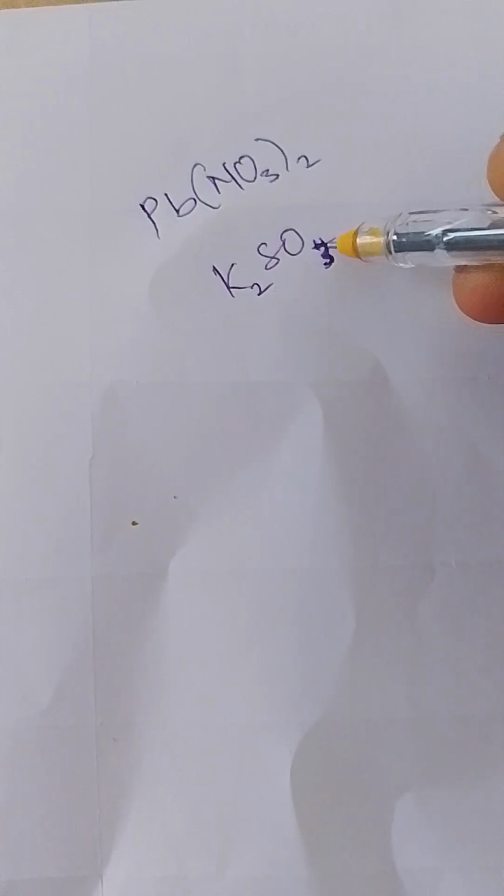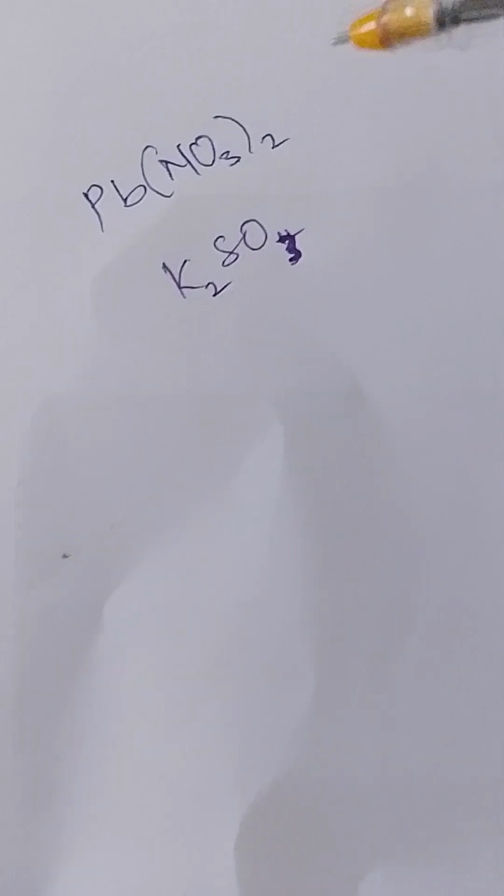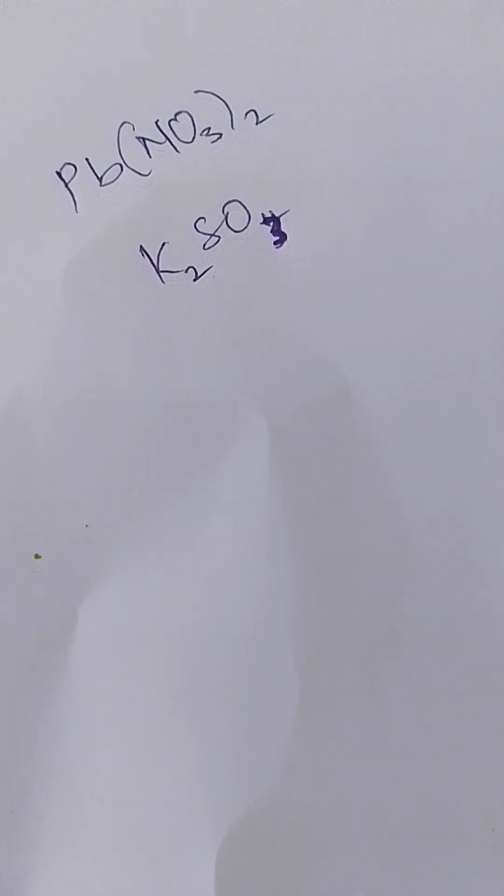K2SO4. All right, and from basic knowledge of chemistry, we are not sure they will ask us to mix these two together. Potassium trioxosulfate(IV) is K2SO3. Sorry about that, SO3. You know how SO4 is most common, and my hand wanted to write the most common one. Even my mouth said the correct one, but the hand, one of those things. All right, thank you for that.